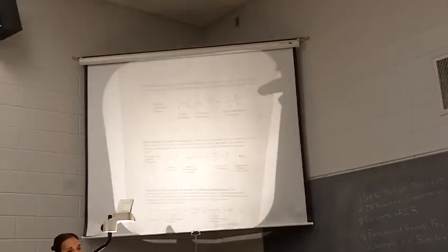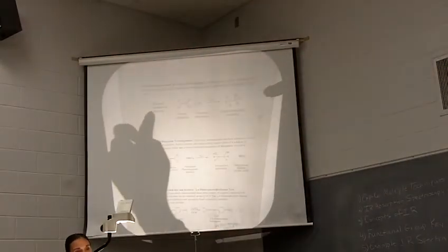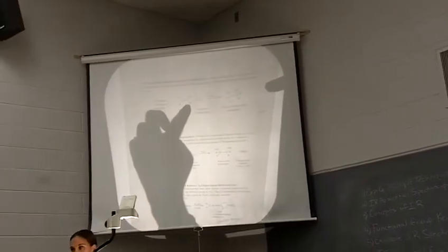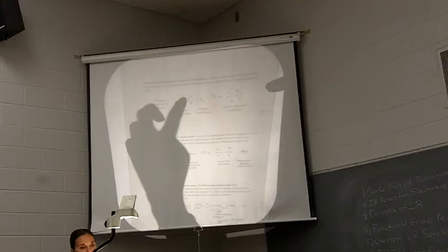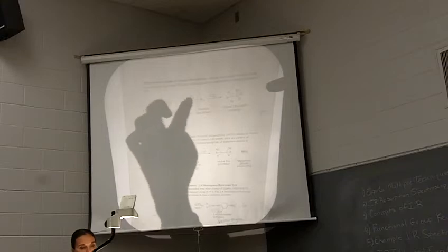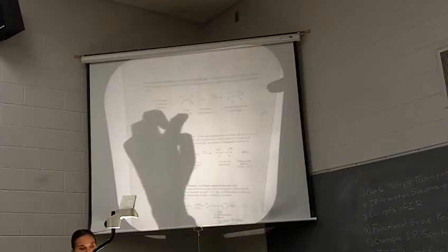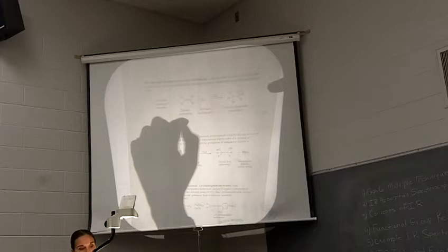So the bromine test reacts with alkenes, okay? And so the alkene, whether it's a liquid or a solid, is dissolved in a solvent, because you use dichloromethane as the solvent here, and you're going to have some sort of colorless solution, okay?